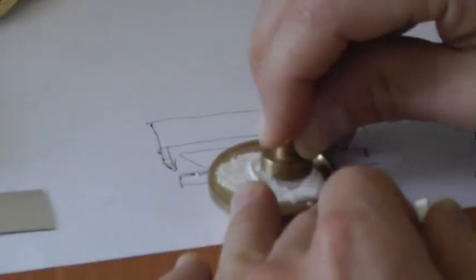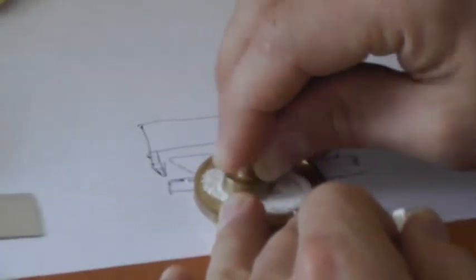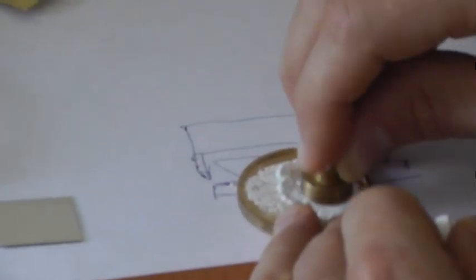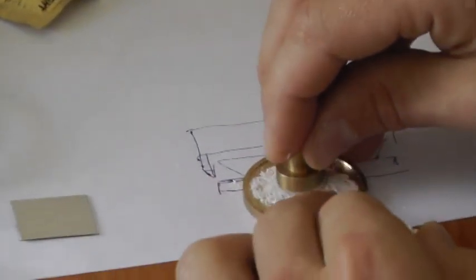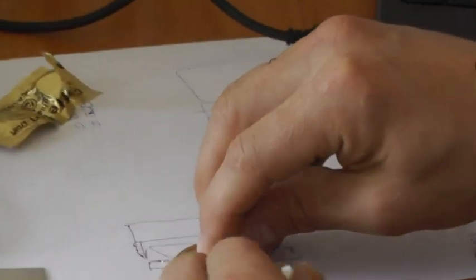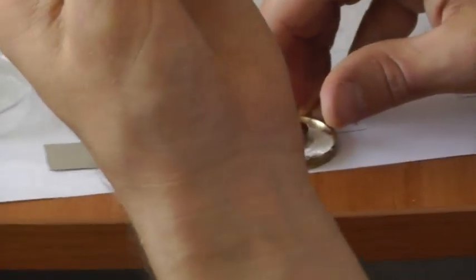Ideally, the powder particle size should be the smallest possible, because it will easily adhere to the surface, and the particle size will be just like the laser spot diameter, about a few microns.